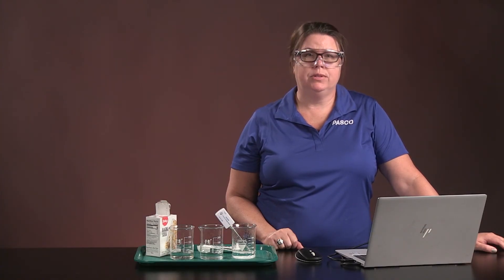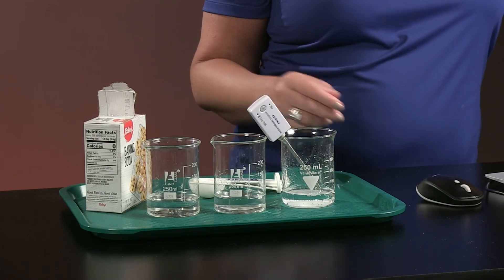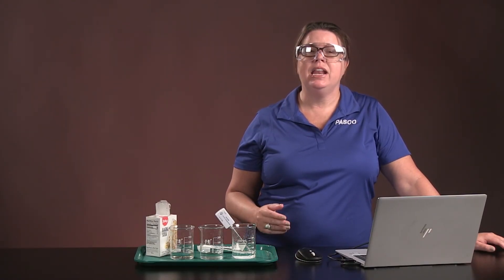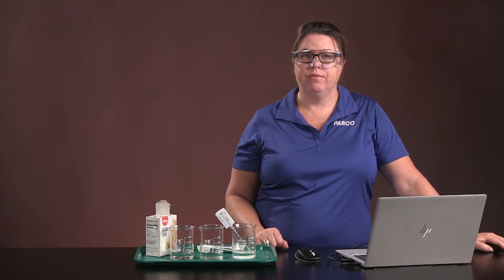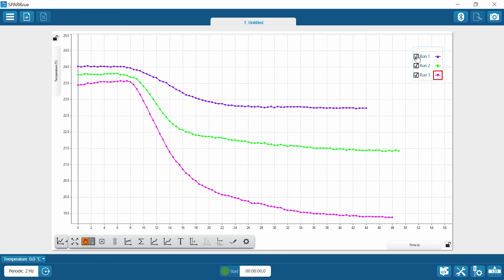We used different amounts of baking soda in each run. We can use the data from our three runs to see if the amount of baking soda added had any effect on the temperature change of the vinegar. Let's go to our SparkView data. If I want to see all of the runs at once, I just click on each run and it brings them up.